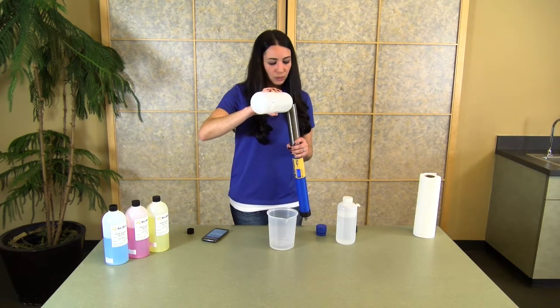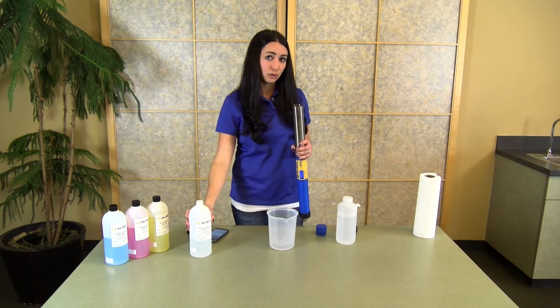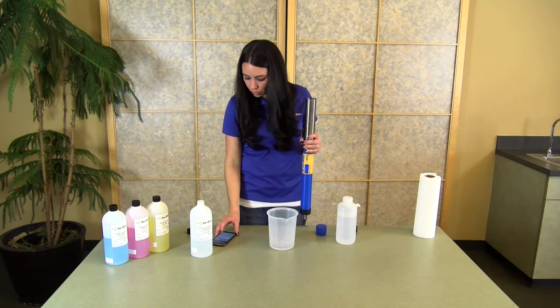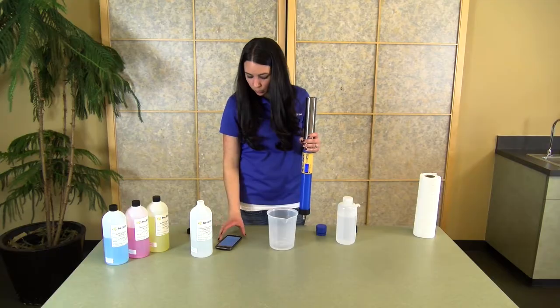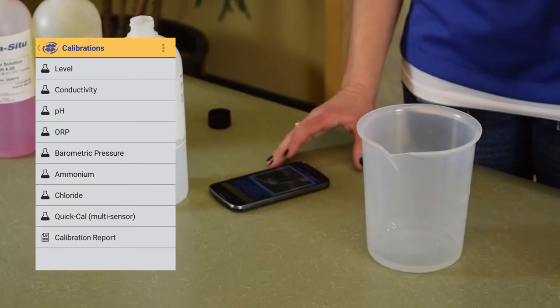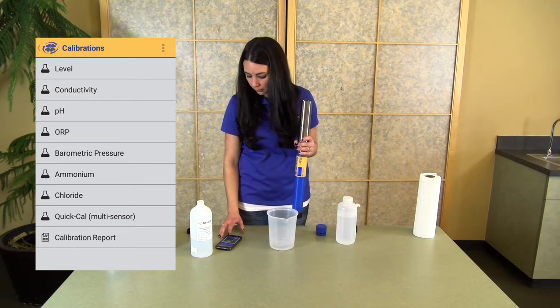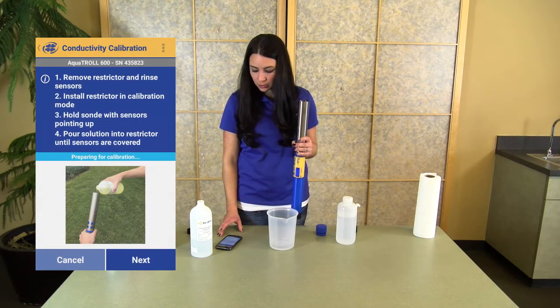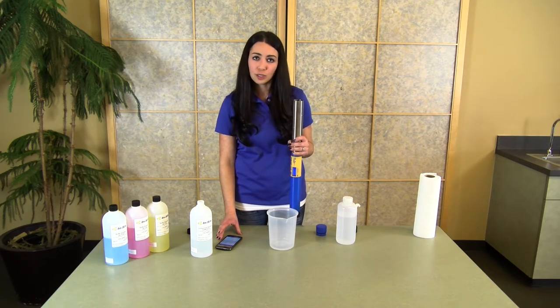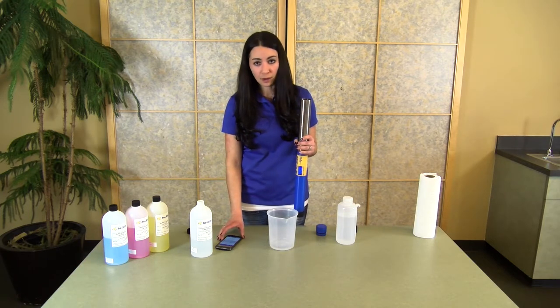Once you're ready to begin your calibration, fill the chamber with a little bit of your calibration standard. Always use the calibration standard that's close to the actual conductivity or pH of the water you're going to measure. From the Connected Instruments page in the app, click on Calibrations and pick whichever calibration you are planning to perform. Some sensors have options for one, two, or three point calibration, so make sure you pick how many points you want. Click Next to go into your calibration screen. The calibration will be auto-detected based on whatever standard you're using, as long as it's a traditional standard, but you also have the option to input a different value if needed.